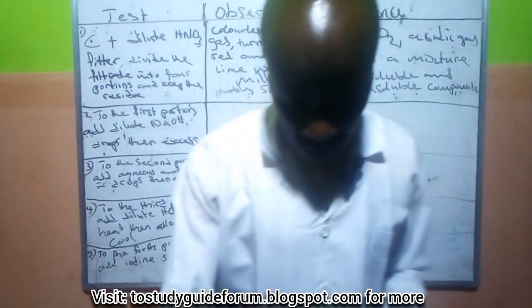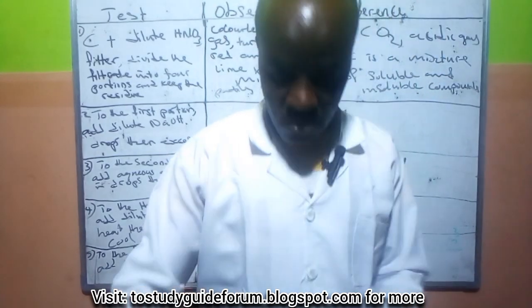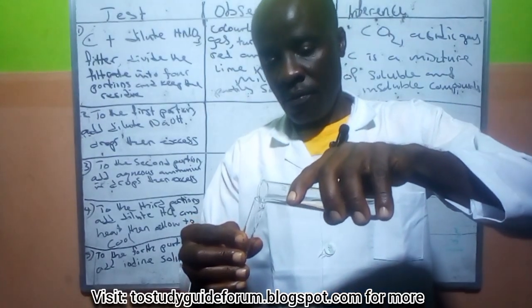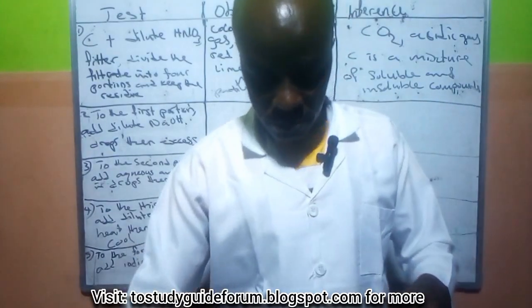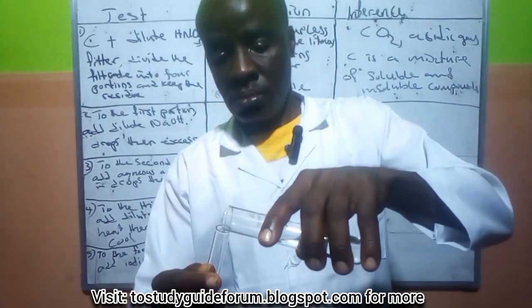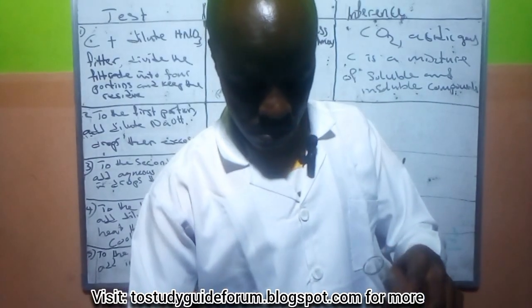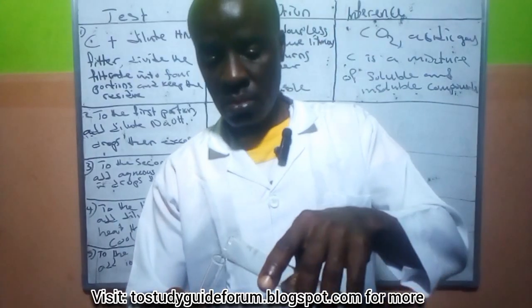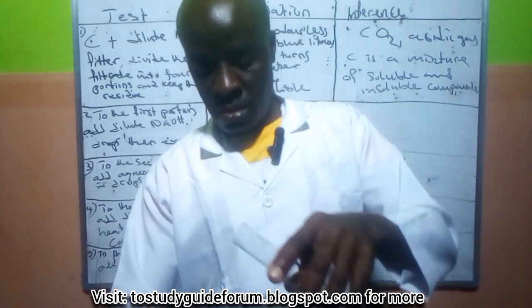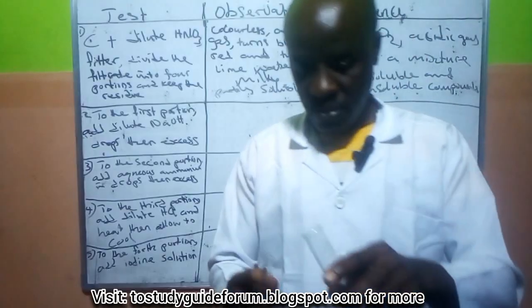We said divide into 4 portions. We're going to be dividing into 4 portions. This is portion number 1, two, three, and finally we have our 4th portion.